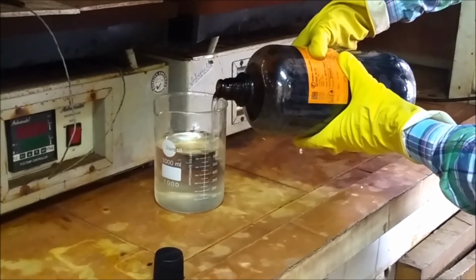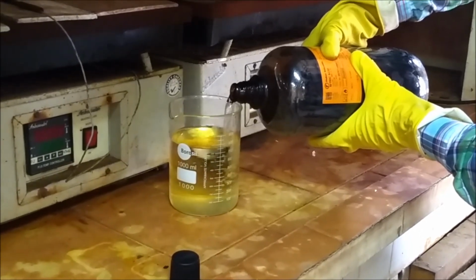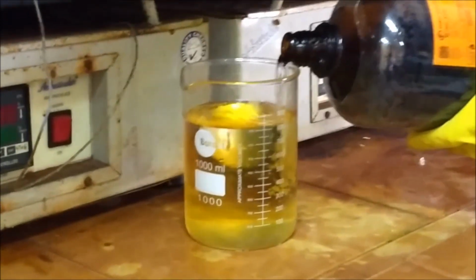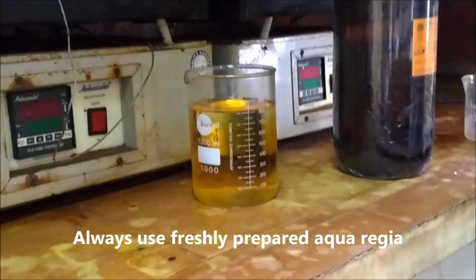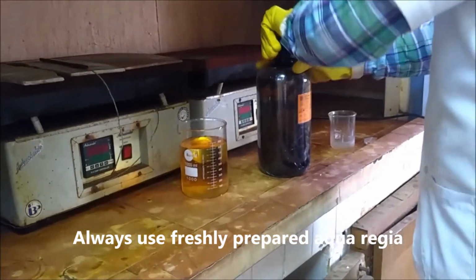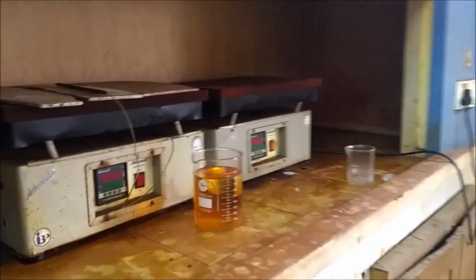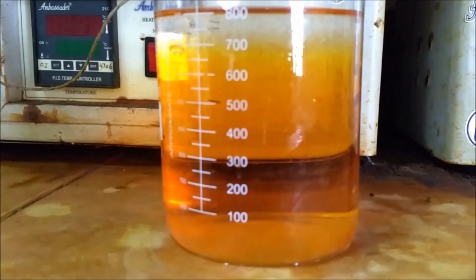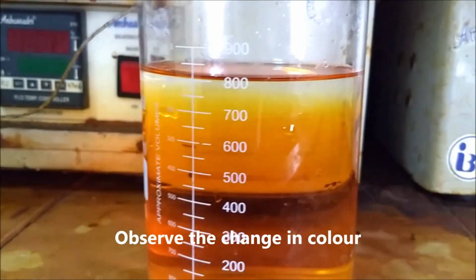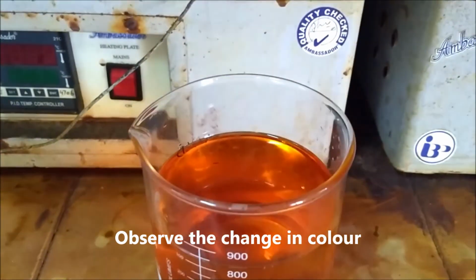And at that time we have to be very careful because these are highly concentrated and corrosive also. So you can see that this is 800 ml aqua regia. There is a change in color. From transparent it will become orange, and then red and brown.